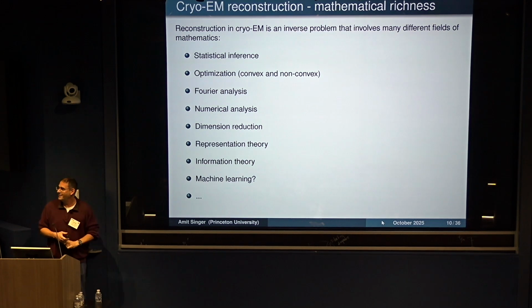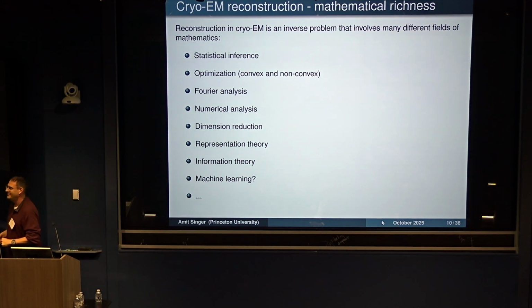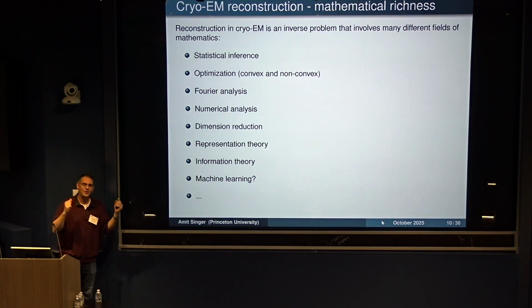Okay, I've got a question. Yeah, good. Does HI depend on the angle? It does not depend on the angle. You had a subscript, right? Yeah, it's a subscript, but it's the same HI for all. It's the same H for all molecules in the same micrograph. We use different defocus values. Okay, that's why it depends. Okay, but I don't want to go too much into the physics. I know there are physicists here. I'm going to disappoint you.